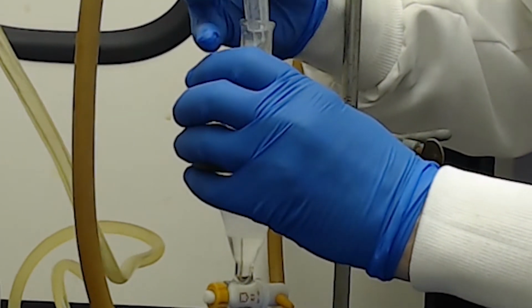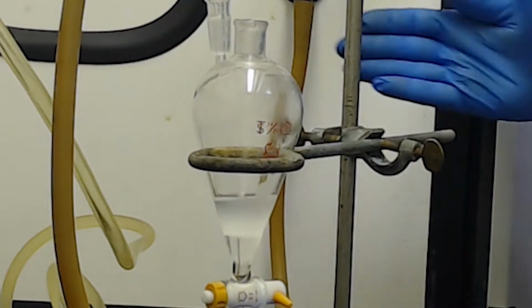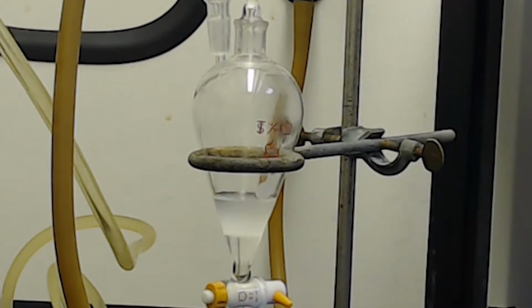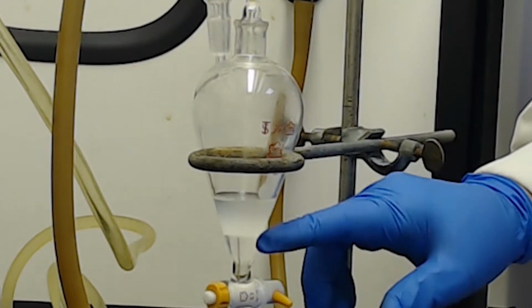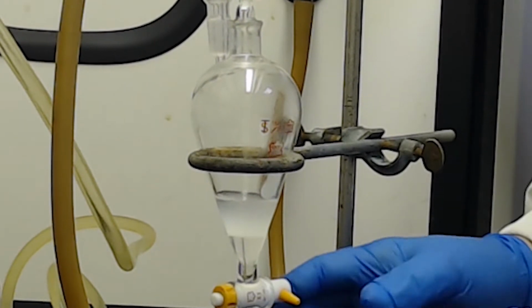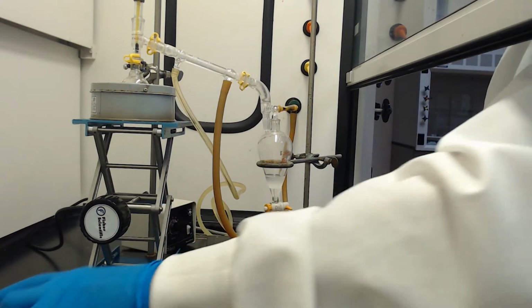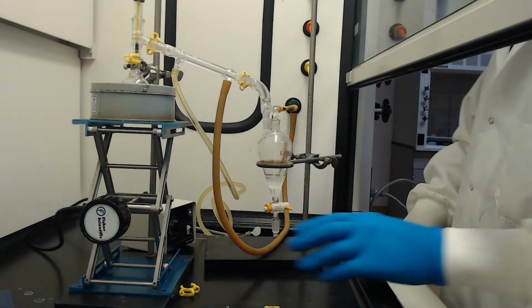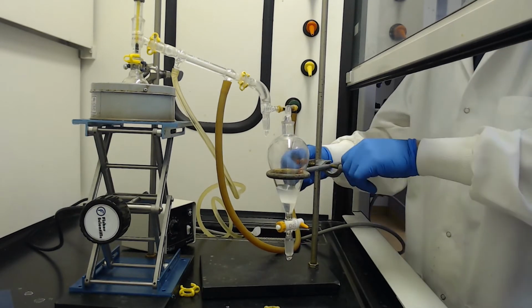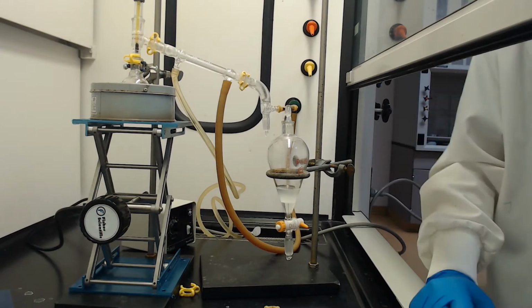So now our product is pretty volatile. So we still have this cap, and we want to keep on using this cap when we can to keep our volatile product in here. This is pure product. We're not going to be diluting it with a solvent. So when we get after the drying phase, it should be all set to go. So we're going to get to our extraction phase. So let me set up the glassware and get that prepped up, and we'll get to it.